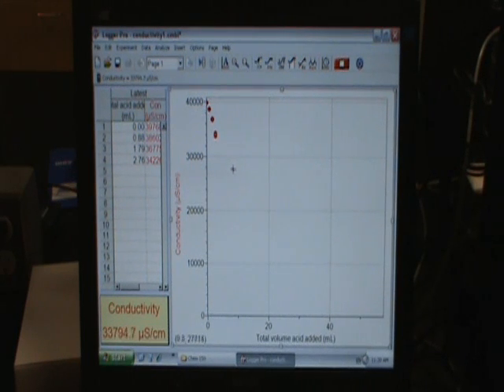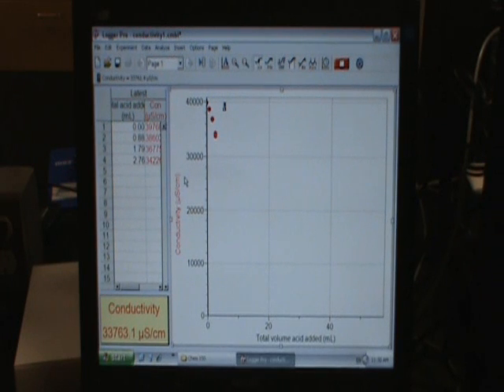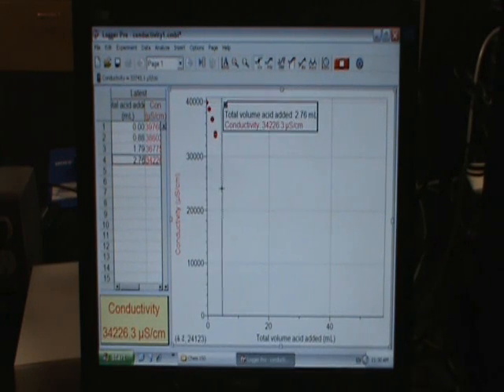A couple other features that might be useful. Let's take a look up at the analyze menu. If we look at examine in the analyze menu, what did it do? It doesn't look like it did anything. But what happens when I bring my cursor over here? Analyze, examine steps you through each of your data points. So, if I want to know what that data point is, it's showing me in this box.